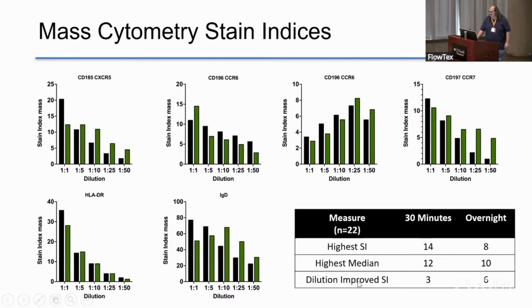Okay, the highest median value for the positive group was actually higher in 10 of our overnights and 12 of them that were in the 30-minute stains. So once again, like I said, they did a great job at Standard BioTools getting these particular markers titrated.